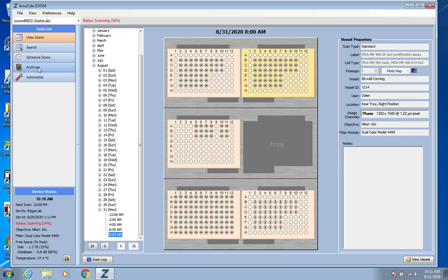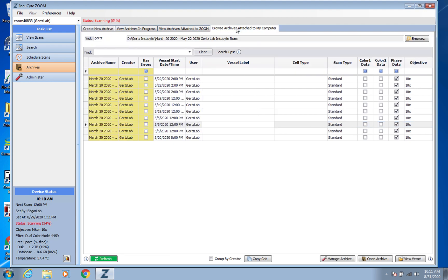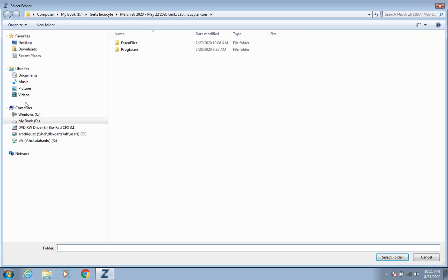So in order to do this, I'm actually going to go to some of our archive data. So just as a reminder, go over to archives, browse archives, attach to the computer.